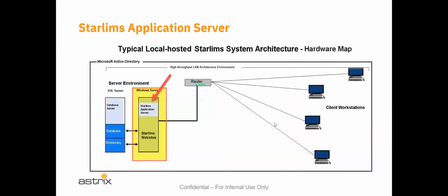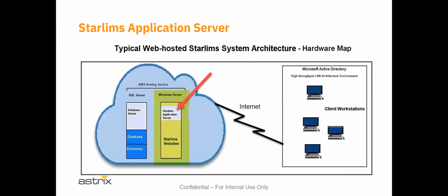So this is a local-based web server, rather, I'm sorry. And this is handled in-house within an Active Directory, Microsoft Active Directory, and you've typically got administrative people that handle that kind of thing within the walls of a specific company. But STARLIMS also supplies a new tool called the web-hosted STARLIMS Cloud System.